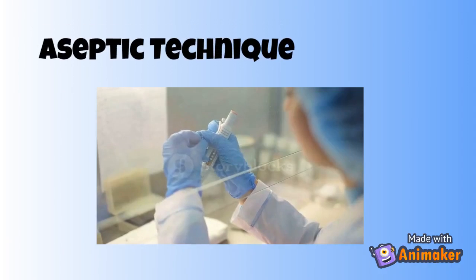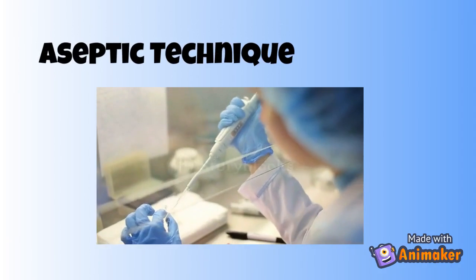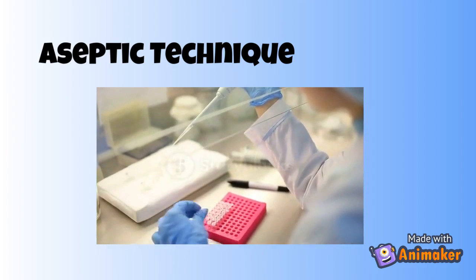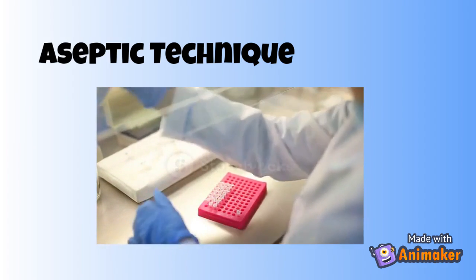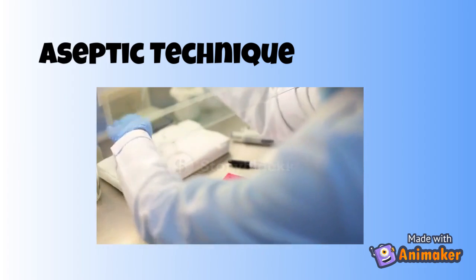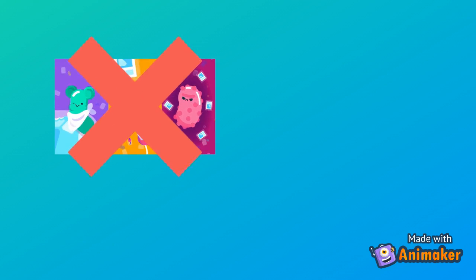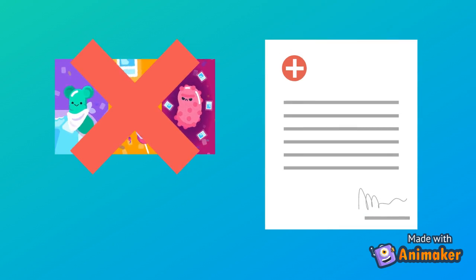Aseptic technique is derived from the word asepsis, which means the absence of pathogens. Aseptic technique can be defined as a group of procedures that prevent contamination by microorganisms through knowledge and principles of contain and control. The purpose of aseptic technique, done before any laboratory activity, is, first, to exclude contamination by establishing a strict code of practice.